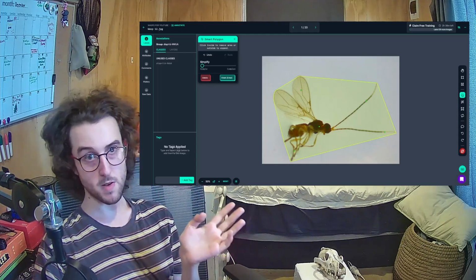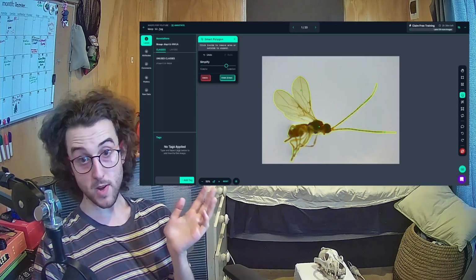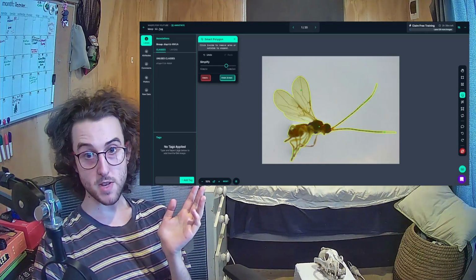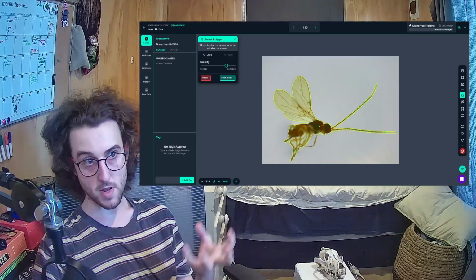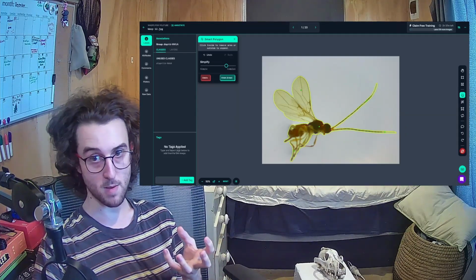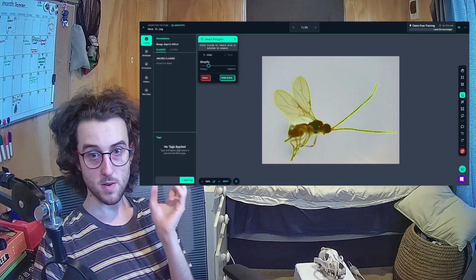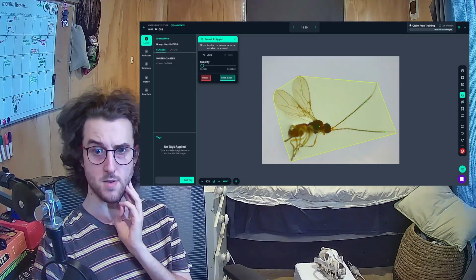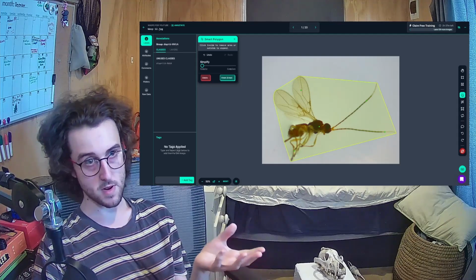There's a trade-off here. If you have a really powerful computer, you can go complex, you'll get a really, really nice fit, but the cost is, it's going to need a lot of processing power, because this is a much more complicated polygon. Whereas, if we come down to a simple polygon, although it's rough, it still generally contains the wasp, and you're able to process it easier.